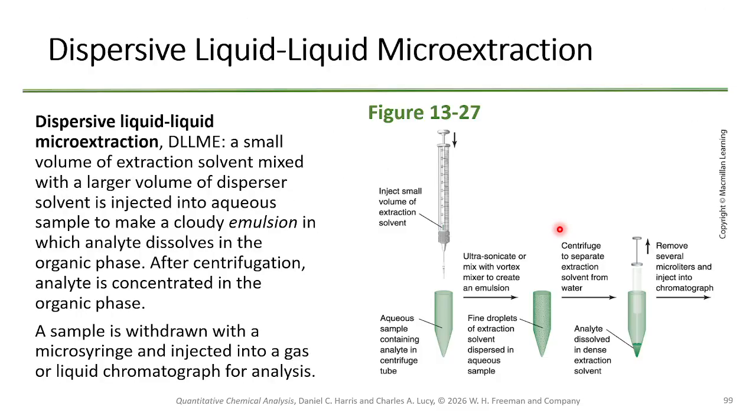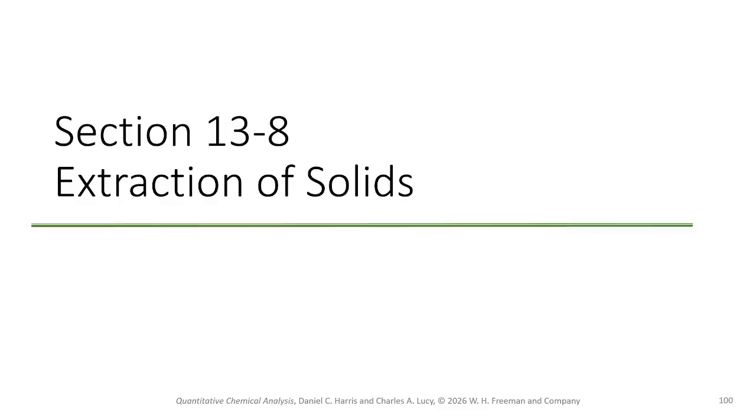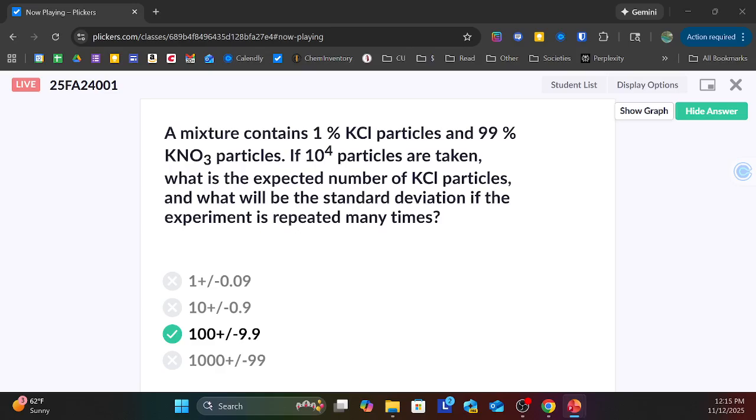Okay. Micro extractions are becoming really important, by the way, because you can work with much smaller quantities, but they are a lot more finicky.